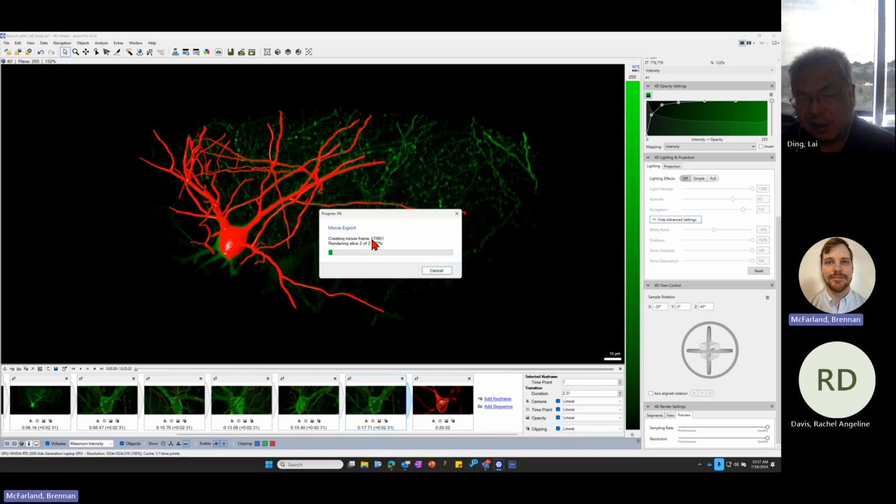That's what I think it is, because it's handling them as separate objects. Oh, they are separate kinds of tags to it. So we have our, kind of like how it says with tree versus volume. My guess is that it's the same thing here. This is quite slower. Yep. It does take a little bit of time.